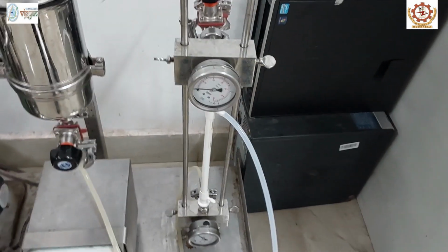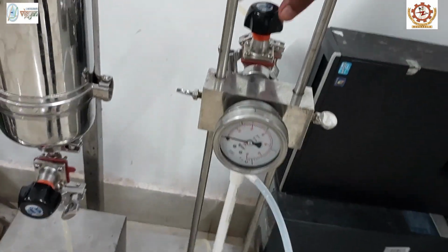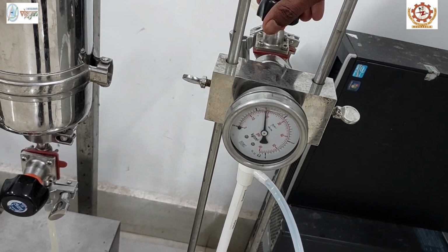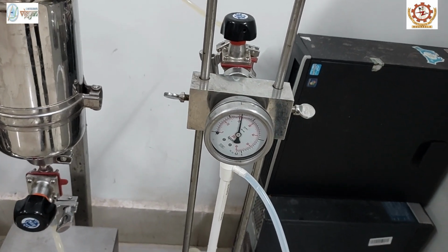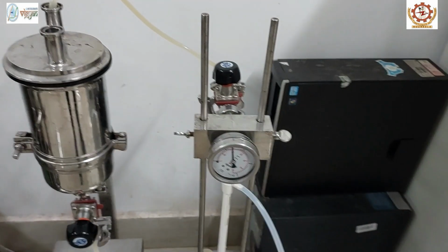Now for the clarification, we have to apply transmembrane pressure by closing the pressure valve. I am increasing the pressure to 20 psi. 20 is the maximum psi this particular membrane can withstand at 20 degrees Celsius.